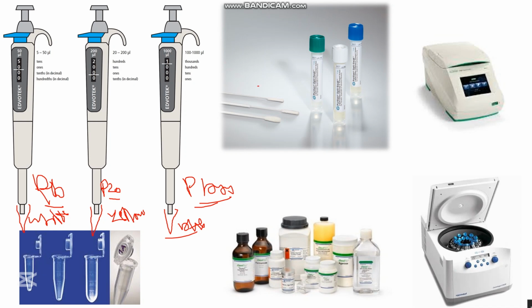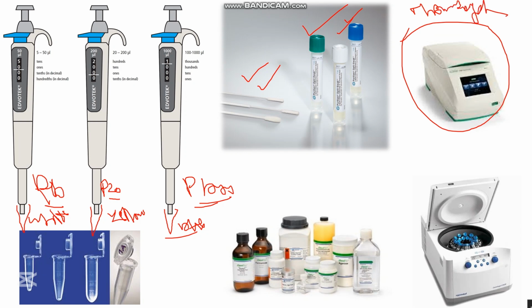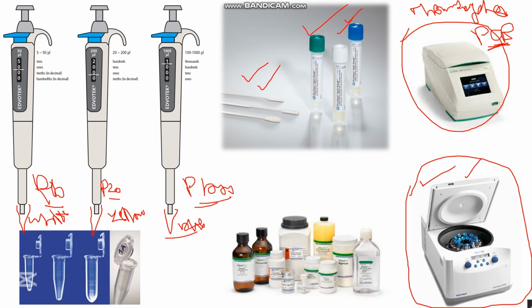We also use swabs for collecting samples. We also use different types of containers. We also use the thermocycler, which we use for PCR, the polymerase chain reaction. We will talk about it later. We also use the centrifuge machine for separation. We also use reagents in molecular biology labs, and we also use Eppendorf tubes.